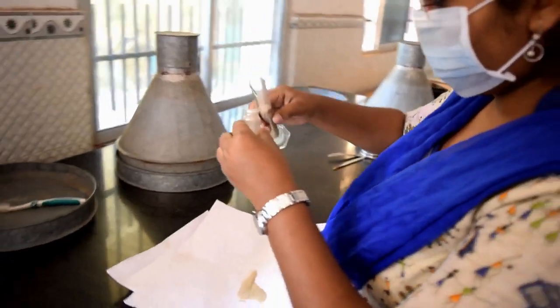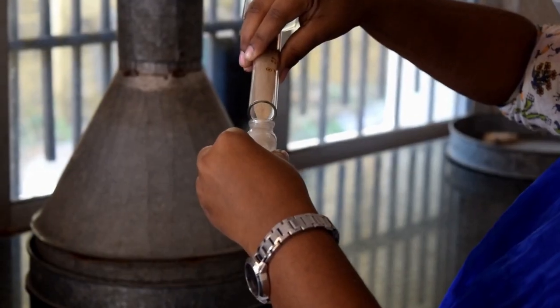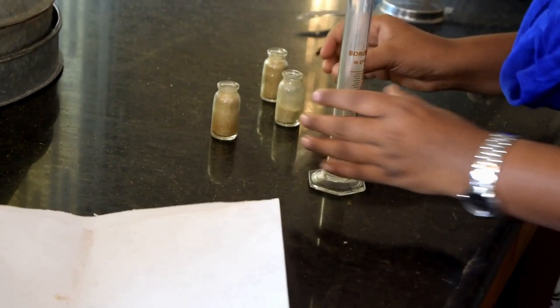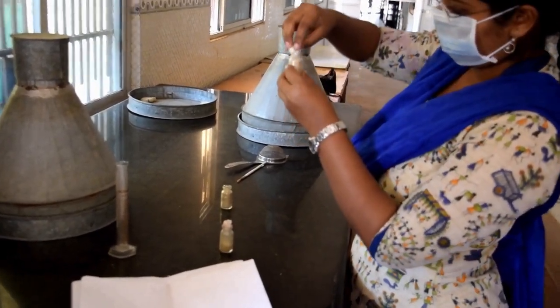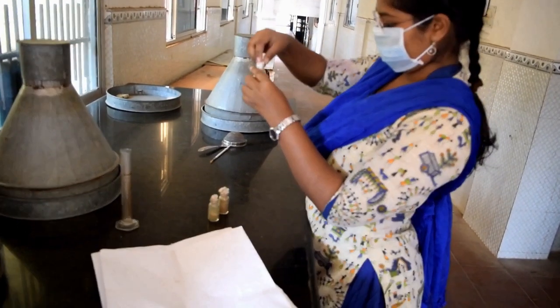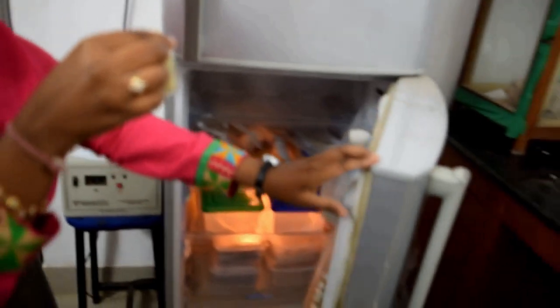Eggs are measured in cc and put in glass or plastic vials. The mouth of the vials are closed with cotton balls. The eggs are stored in refrigerator at 5 to 10 degrees Celsius for 1 month.